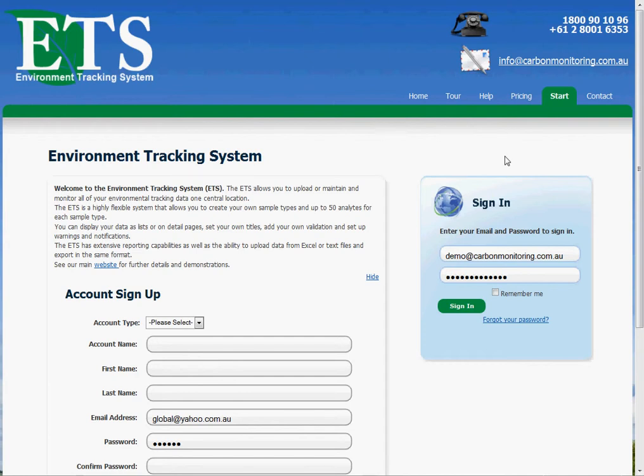Hello. Today I'm going to give you a demonstration of the ETS, the Environmental Tracking System from Carbon Monitoring. In the previous demonstration I showed you how to get started, to create an account and get signed in for the first time. In that demo I set up a few sample types using the provided templates. In this demonstration I will show you how you can edit those sample types to meet your requirements.